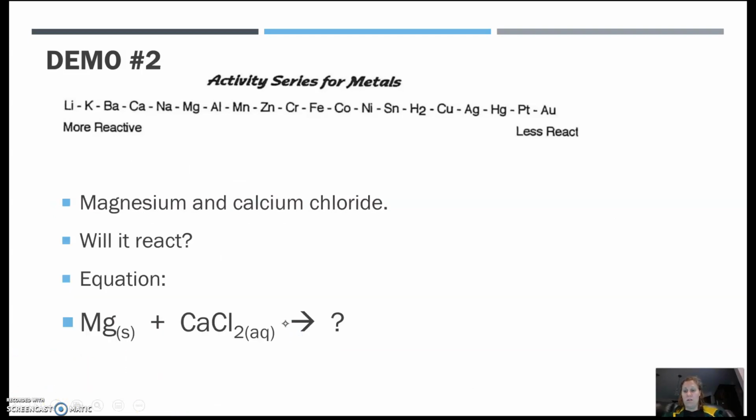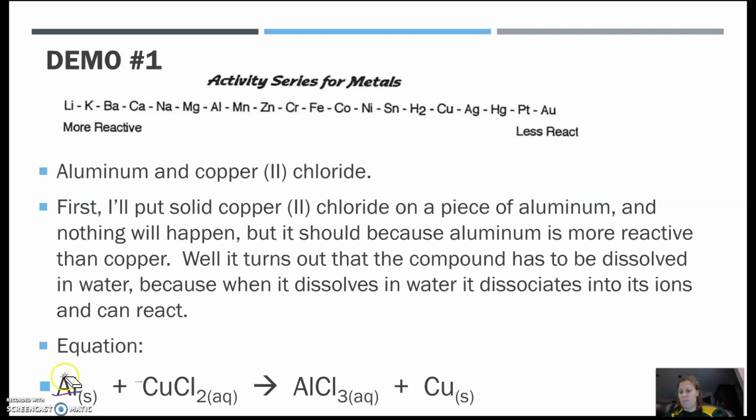Oops, no, well, dang it. I showed it to you really fast, but aluminum is right here and copper is down here. And again, I'm doing this because I have the copper compound that I caught on fire and aluminum foil. Woohoo! But aluminum is above copper, so it's going to work.